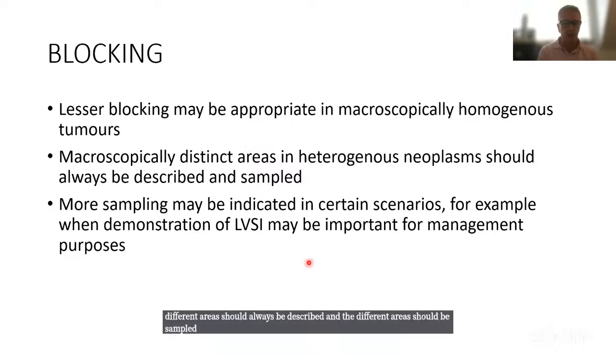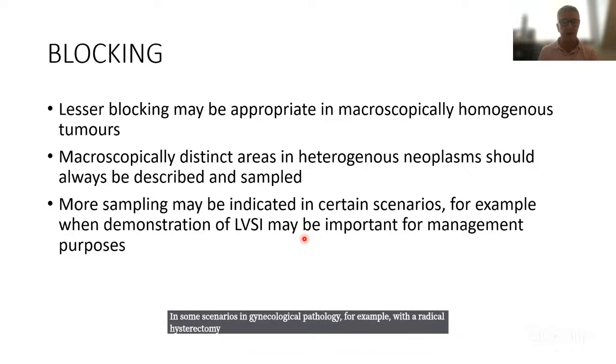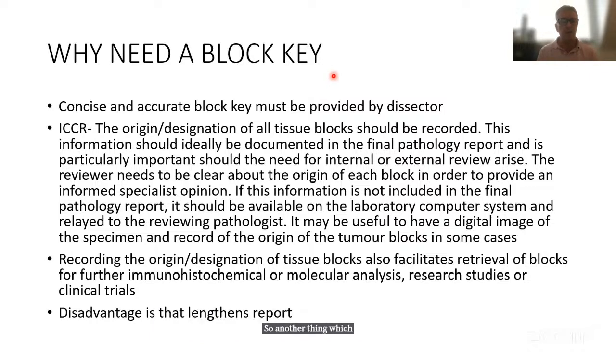And in certain scenarios, you may need to go back. For example, in gynecological pathology, with radical hysterectomy specimens for cervical cancer, if LVSI is present, this may be one of the factors determining adjuvant treatment. So the pathologist may need you to go back to take more sections in a case like this.